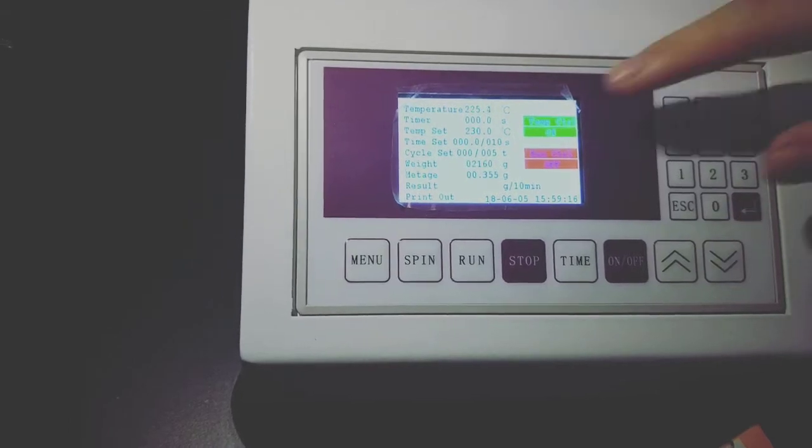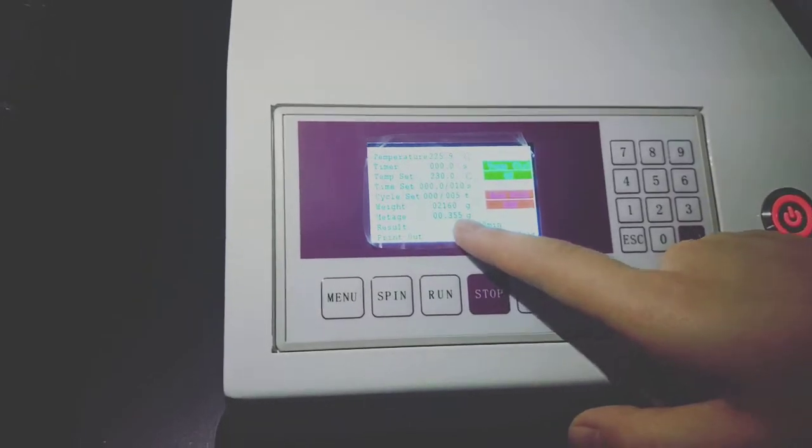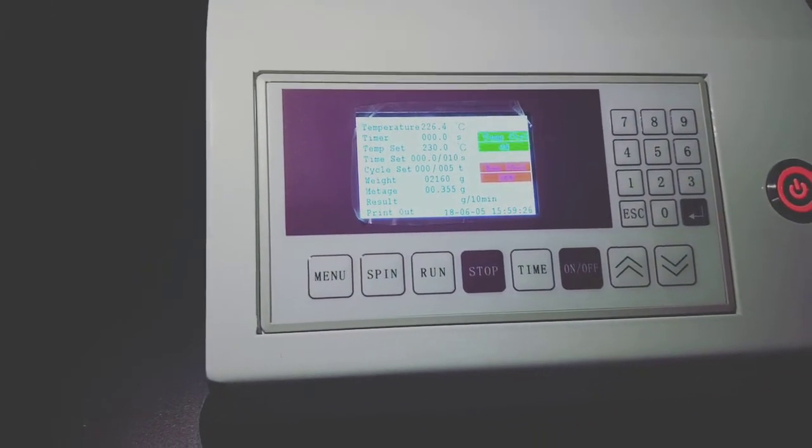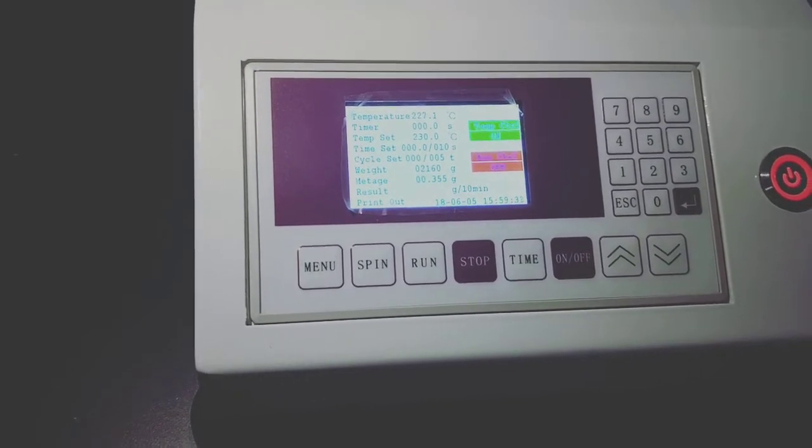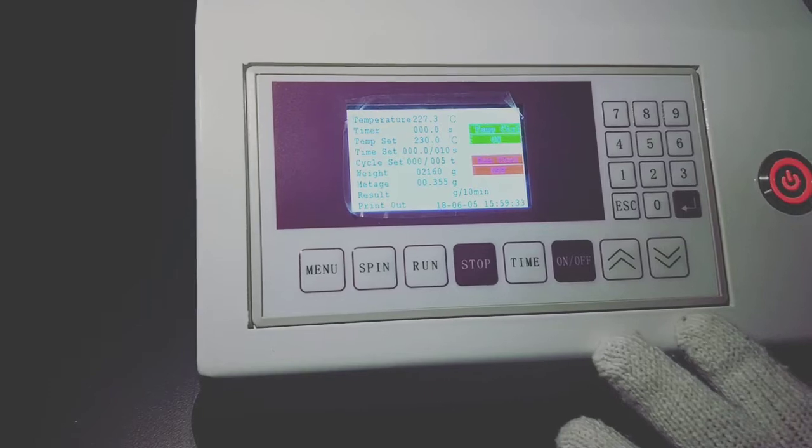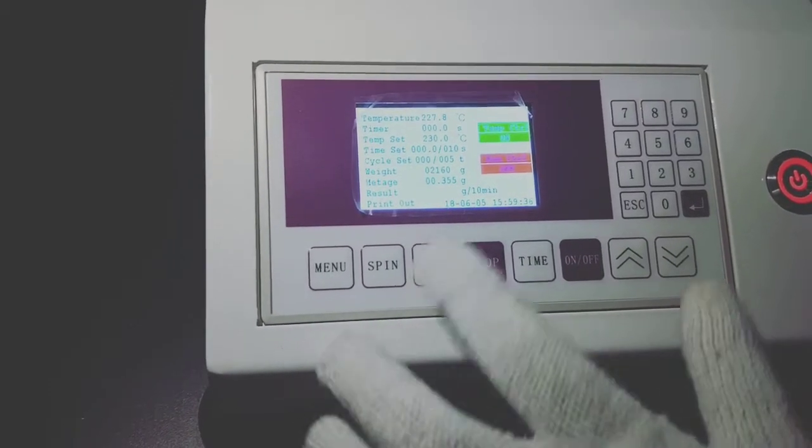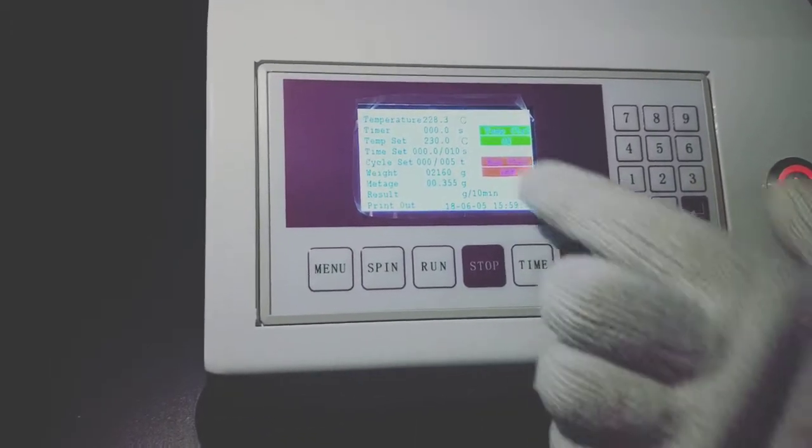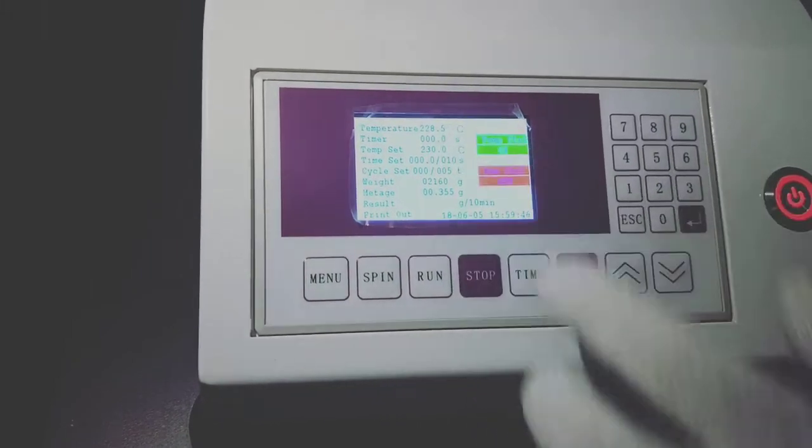We input the weight here and add corresponding weights on the machine. And this metric is the extrusion sample weight. For example, we cut five pieces of sample. Then we measure the five pieces weight. And the calculator gives the average weight of each piece. And then input the average value here. We have set the temperature to 230, and now it's almost reaching the temperature. Now we will introduce the components.